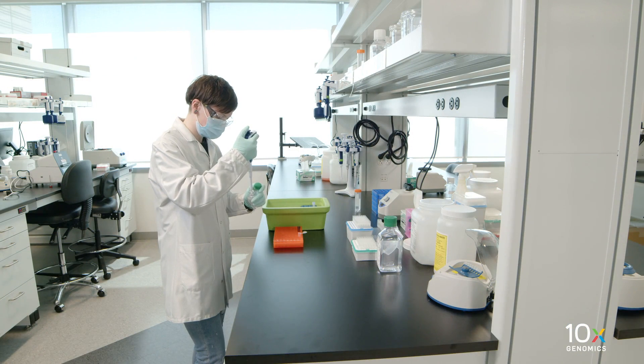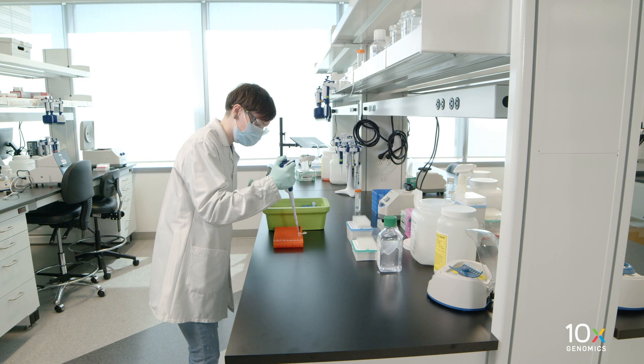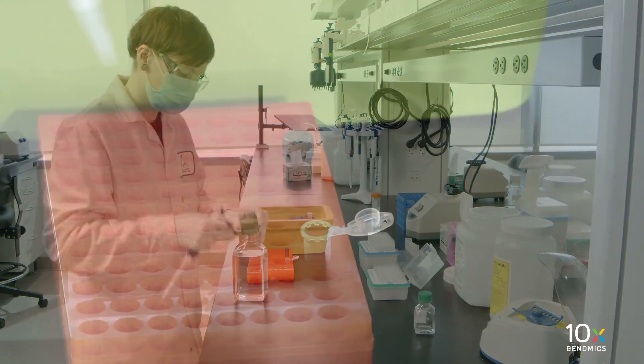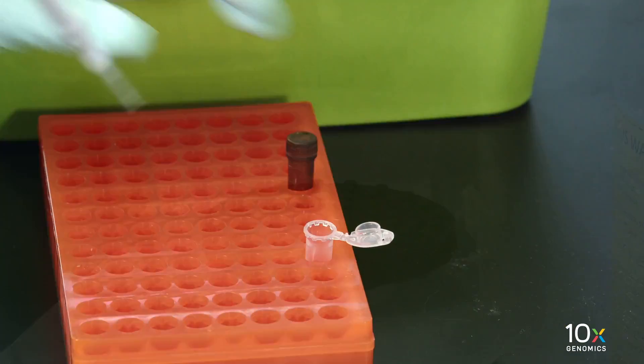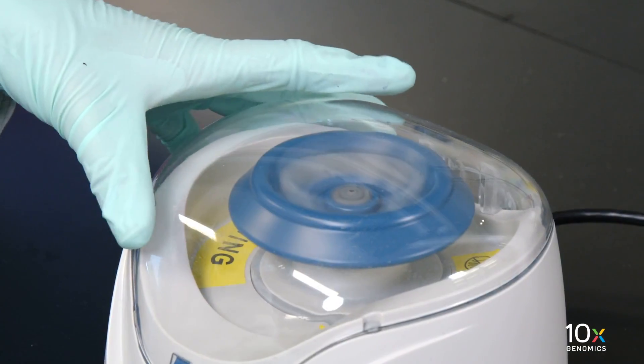Prepare the pre-hybridization mix shortly before using and keep it at room temperature. Add nuclease-free water, 10x PBS pH 7.4, and 10% Tween 20, vortex, and centrifuge briefly.